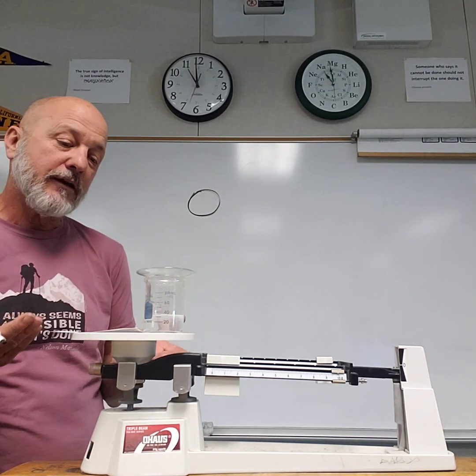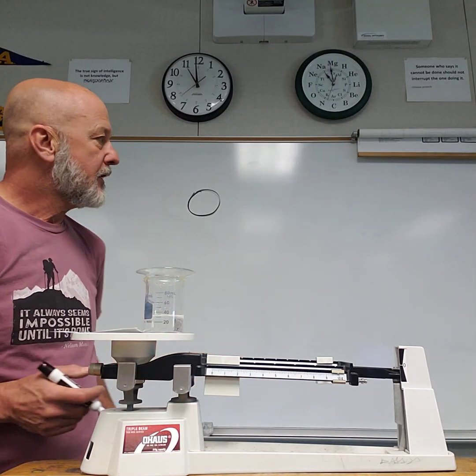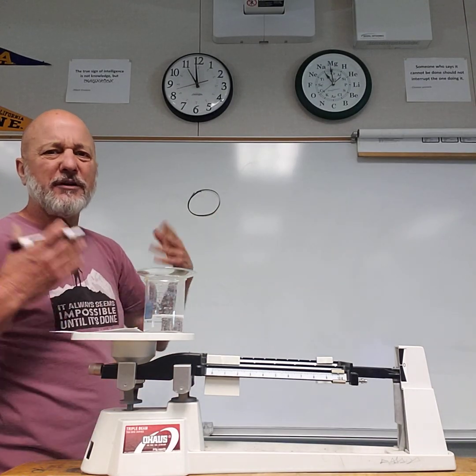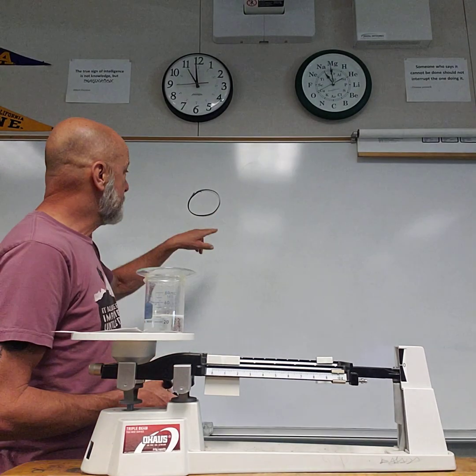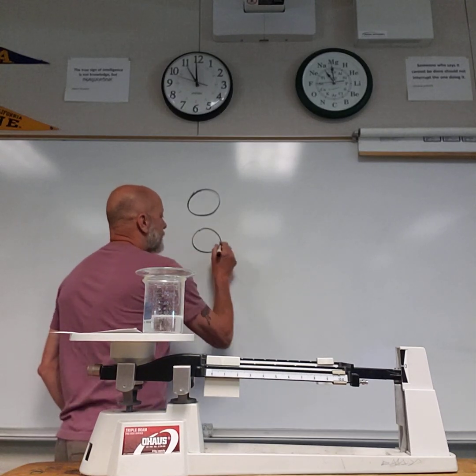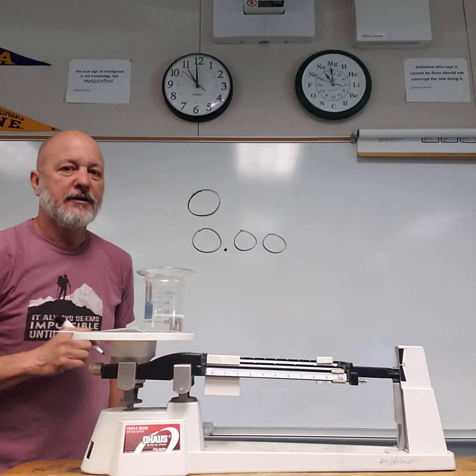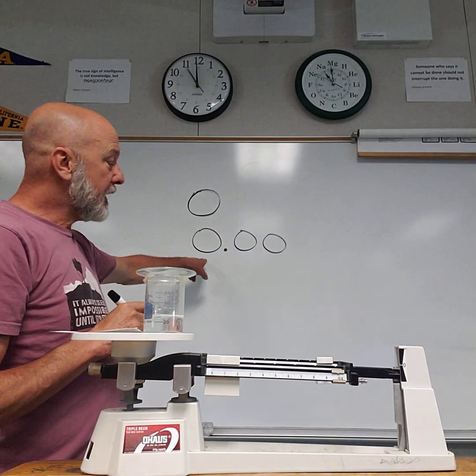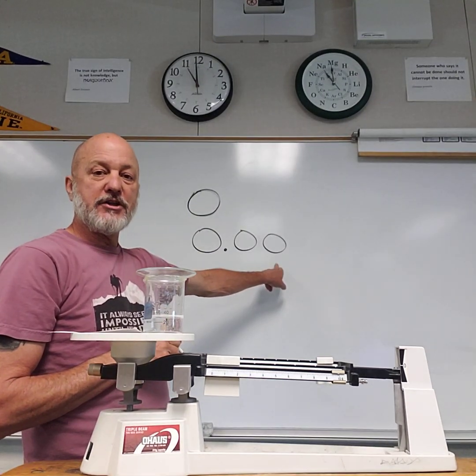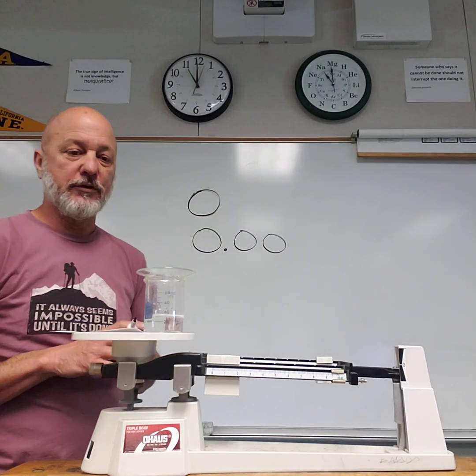Let's look at it. My hypothesis might be, I don't think there's going to be a change in mass. And so maybe on the sugar one, say, well, the sugar's still there. There should be no change of mass. The change of mass is zero. If you really found that it was exactly 0 to the hundredth, then you would say, we had no change in mass. It was 0.00 grams was my change in mass. That is a difference, and it's something that we'll get into.